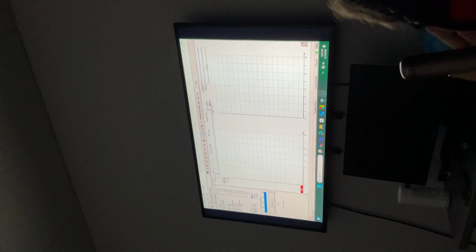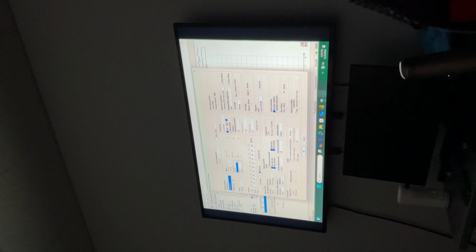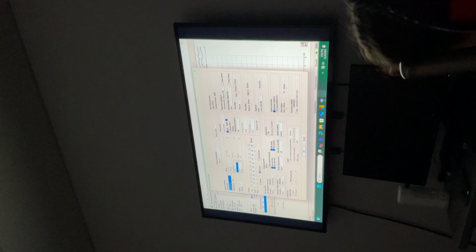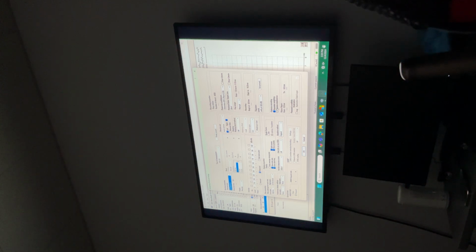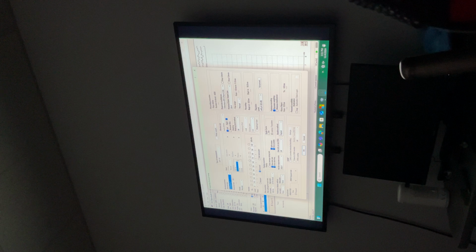So here is the Bayesian weighting. Last class I discussed, it's automatically selected, the Bayesian weighting. My inserts, oh, inserts. ANSD. Oh, here, it's right here. How come we don't select how many sine waves we use, like the number? How come we don't do that here? There's no windowing here.